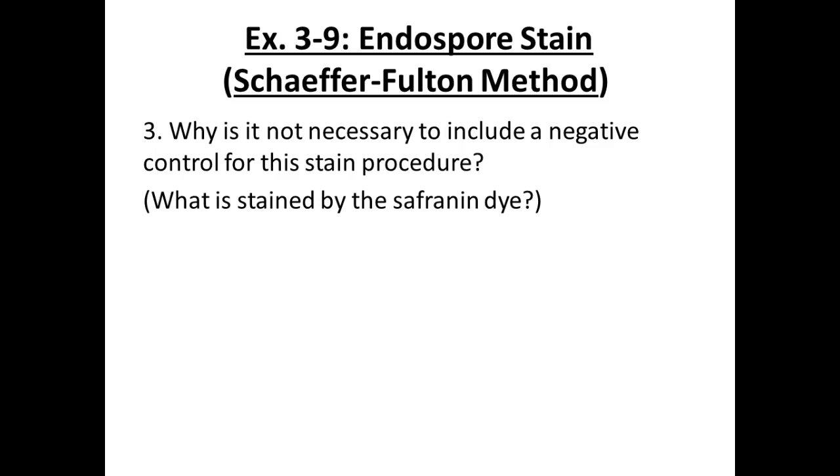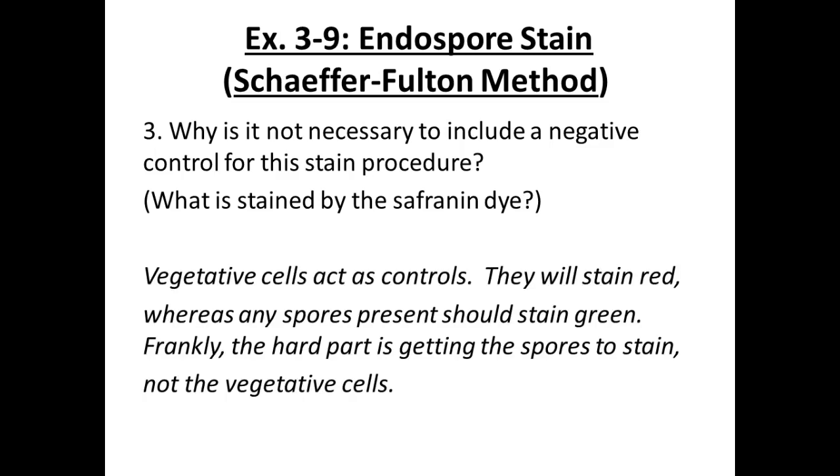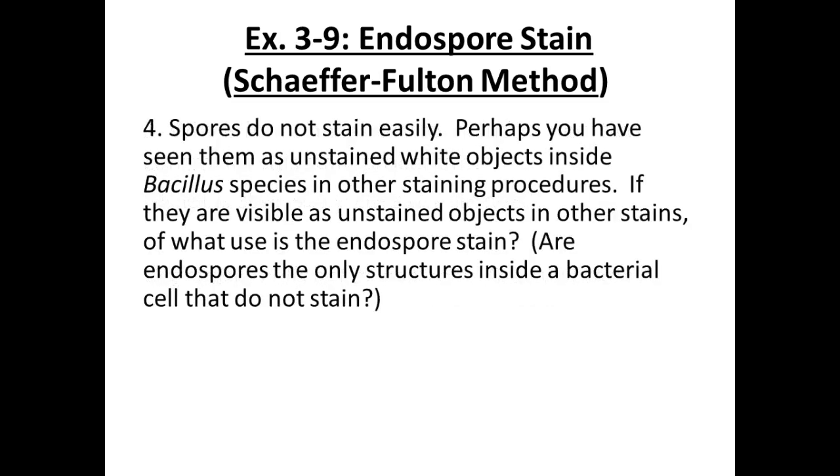The cells themselves. Again, the hard part isn't staining the cells. The hard part is staining the darn spores. Spores do not necessarily stain.